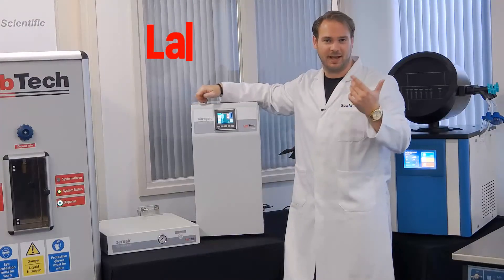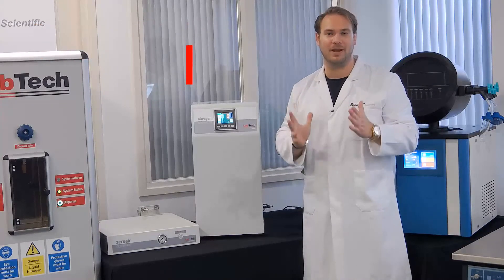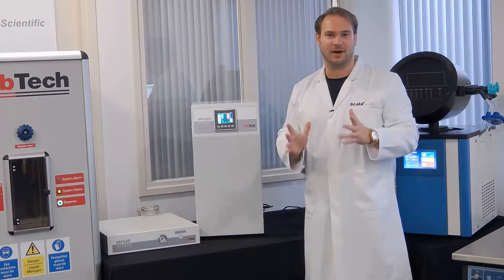This is the Laptek LN1 Nitrogen Generator. From now on, you can make your own nitrogen anywhere, anytime.